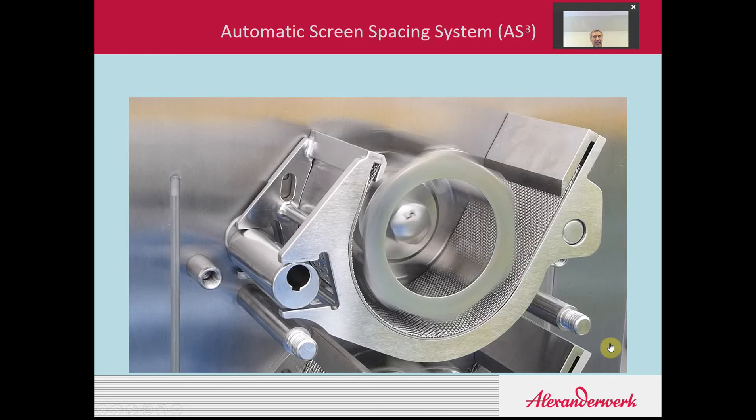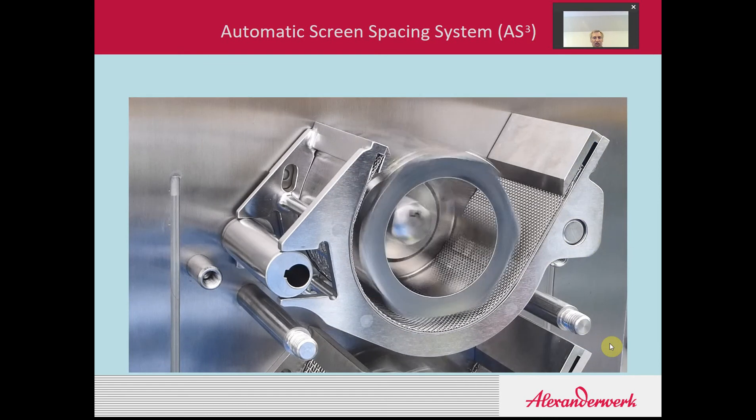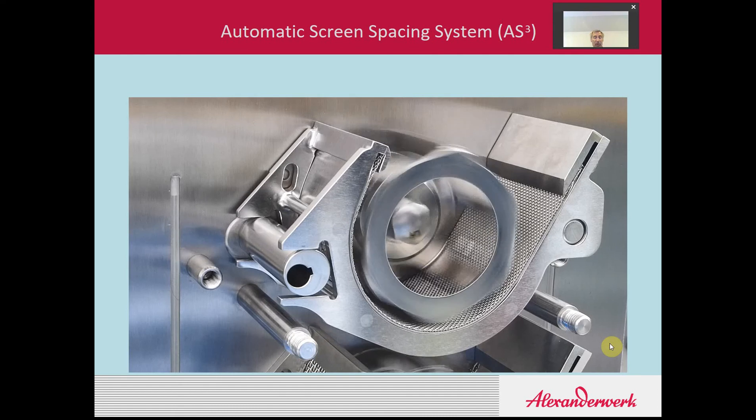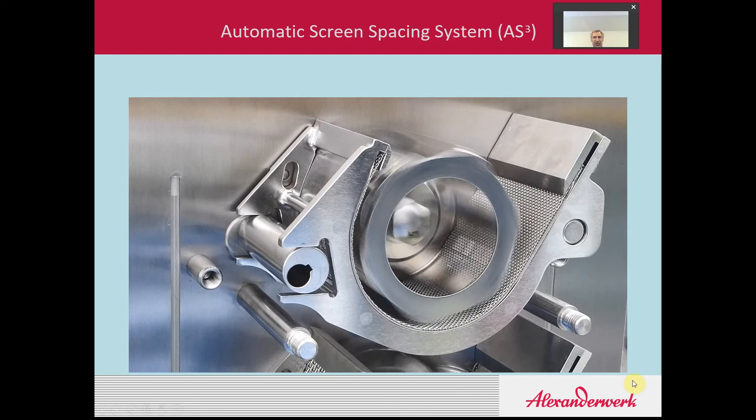Another interesting feature on the WP120 is the AGS system, the Automatic Granulator System. This technology enables the machine to set up the spacing between the rotor and the screen identically every single time. One operator might set up the screen-to-rotor spacing one way, and another operator may set it up differently. By using the AGS technology, we employ a rotating cam that raises the basket up until a vibration sensor just detects it rubbing against the rotor — that's known as the zero point. The spacing is then pre-programmed in the recipe, so you achieve the same rotor-to-screen gap and the same particle size distribution every single time.